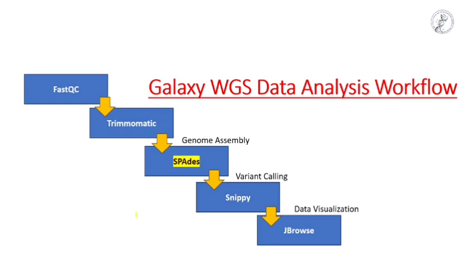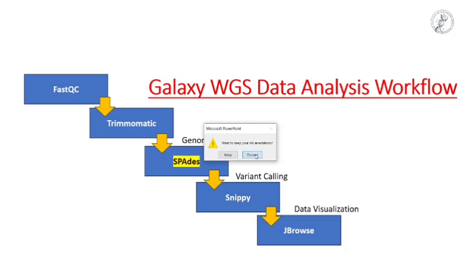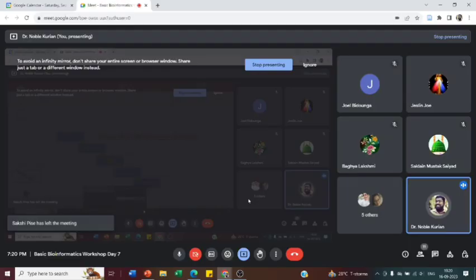So, we are just going through the basics of whole genome sequence data analysis, and then we will see the methodology, how the sequencing is done, very shortly. We will see how the sequencing is done for Ion Torrent and SOLiD sequencing by ligation. I think sequencing by ligation is not being used today. So, these two very shortly we will see, and we will wind up.